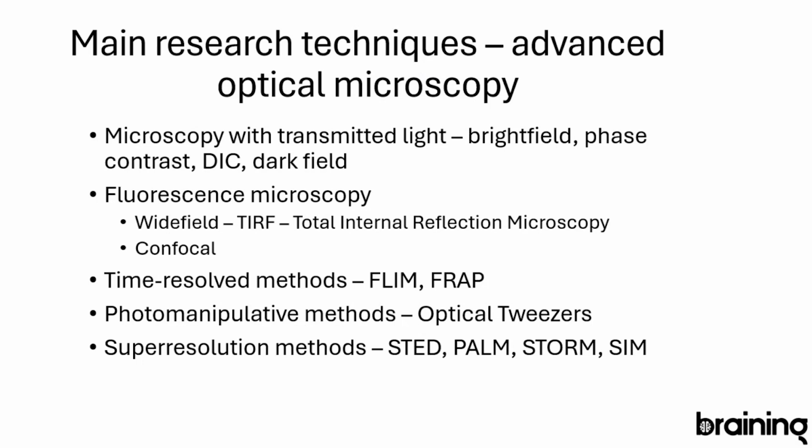quality of the image by showing the edges of the investigated samples, differential interference contrast or Nomarski, which can give us a kind of 3D image of the investigated specimen, or dark field, where especially structures are shown in this contrast.